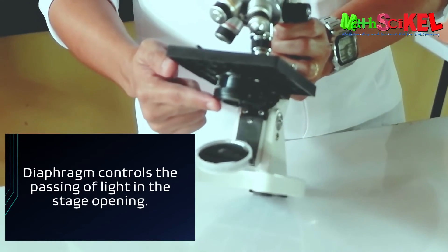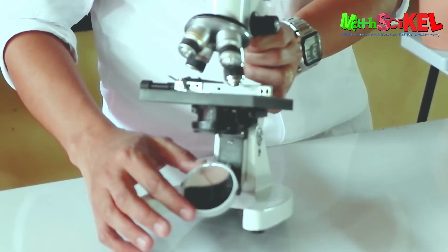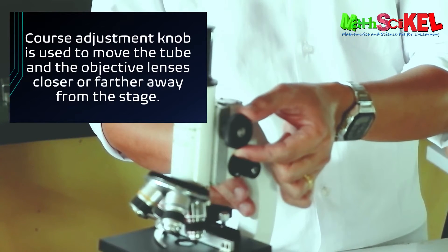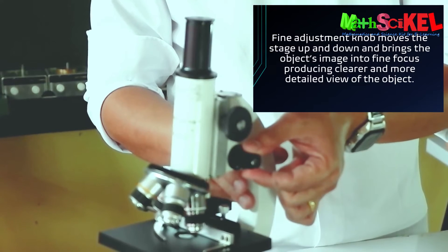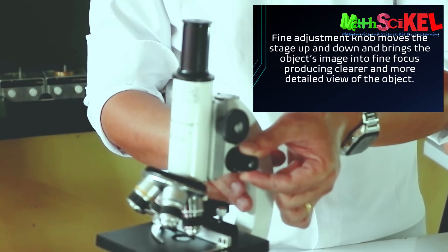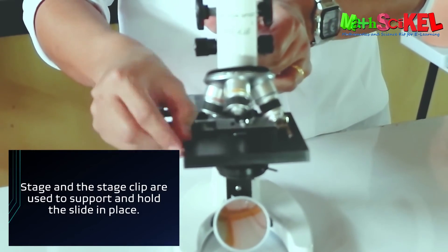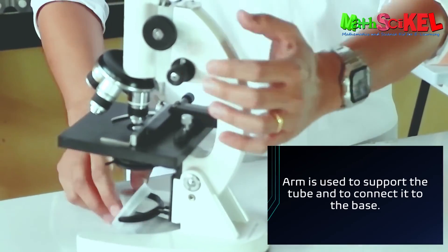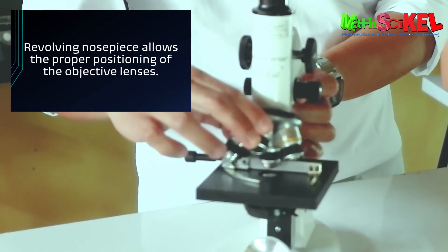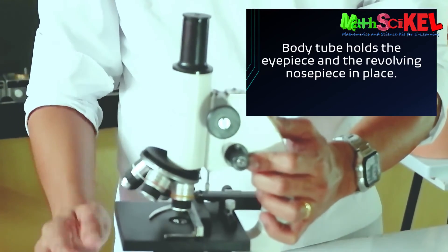The diaphragm controls the passing of light through the stage opening. The mirror reflects the light from the source towards the eyepiece. The coarse adjustment knob is used to move the tube and objective lenses closer or farther away from the stage. The fine adjustment knob moves the stage up and down and brings the object's image into fine focus, producing a clearer and more detailed view. The stage and stage clip are used to support and hold the slide in place. The arm supports the tube and connects it to the base. The revolving nosepiece allows the proper positioning of the objective lenses. The body tube holds the eyepiece and revolving nosepiece in place.